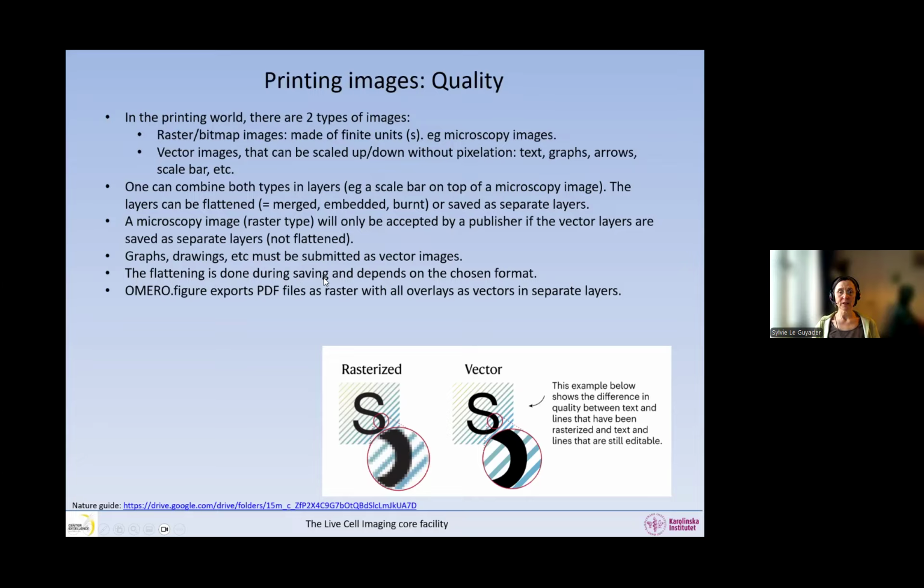By default, when you acquire in your microscope software and you add a scale bar and some annotation and everything, this is saved as a vector image, not flattened to the raster image. So you can toggle on and off a scale bar in your software, and that is because it's not burnt. By default, it's saved as a raster image and a vector image.